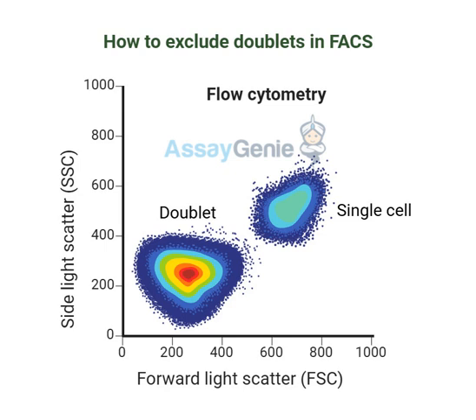And to make sure they're doing it right, scientists often use what are called control samples. Control samples, what are those? Think of them like the known knowns. These are samples where we're absolutely sure that all the cells are single cells. By running them through the FACS machine, we can make sure that all the settings are right and that we're correctly identifying the doublets. So it's like a test run to make sure everything is calibrated. Exactly. It really shows just how careful scientists have to be when it comes to this kind of analysis.